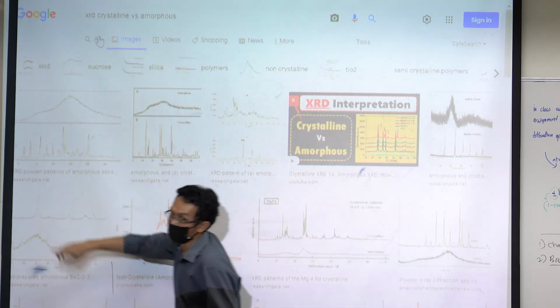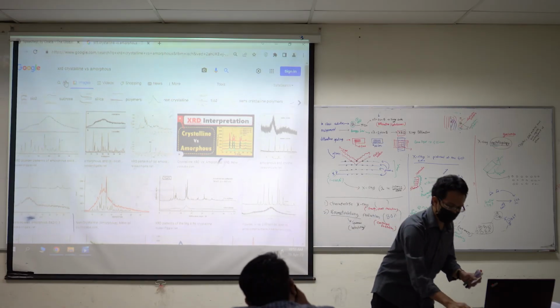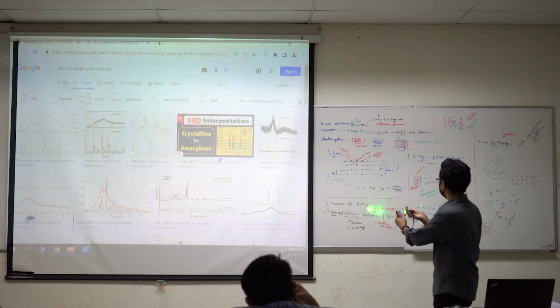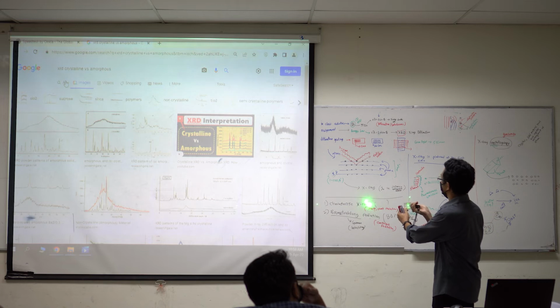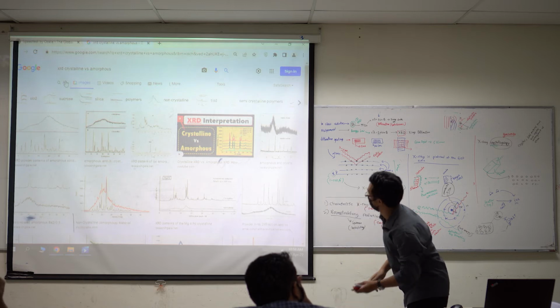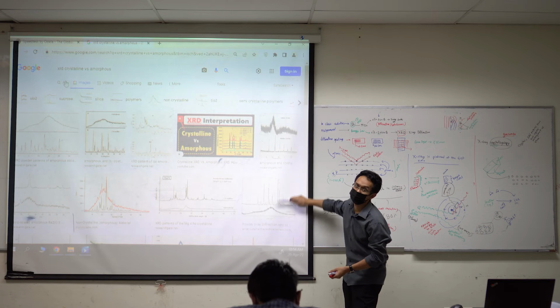The higher the peak, what does it mean? When you see something just like that, the middle one is the brightest. Left or right, it becomes fainter and fainter. So basically, what this shows is that the higher the peak, meaning the brightest part, is the intensity.